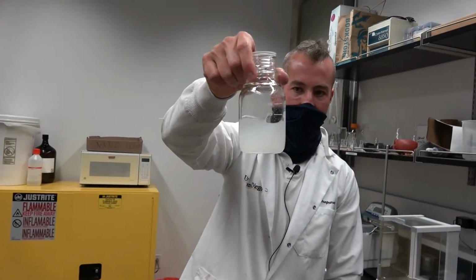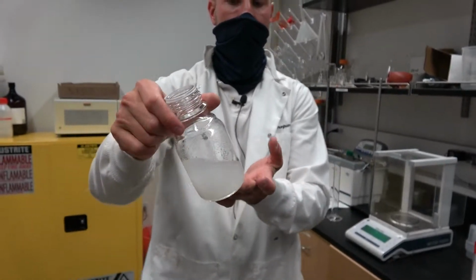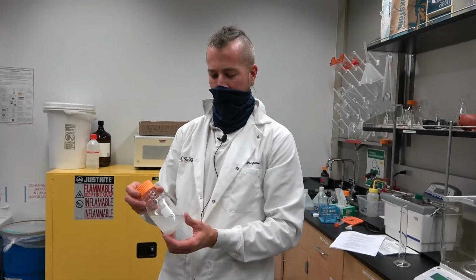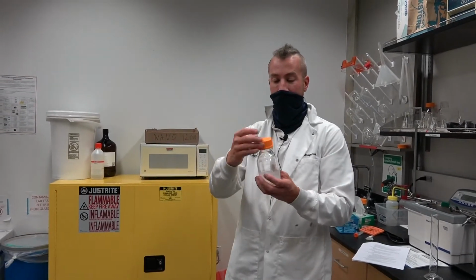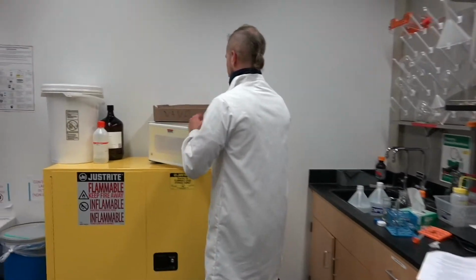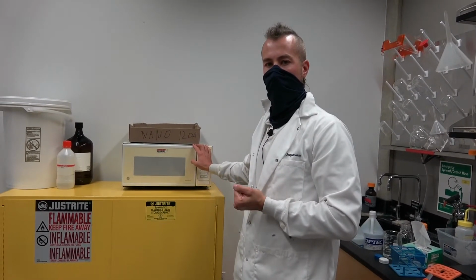Okay, so you can see that this is not really dissolving, right? You can see that I've got this powder in the liquid and kind of chunks on the side. So what you have to do is boil it. There's many different ways you can do this. Well, there's only a few actually, I guess. One is a hot plate, which isn't a very efficient way of doing it, so we can just microwave it. The one thing you have to do is not have the lid tight though, right? Or else you're going to make a bomb. So the lid can just sit on there gently. I generally go for 1 minute and then swirl it, and then another minute and it should be completely dissolved.